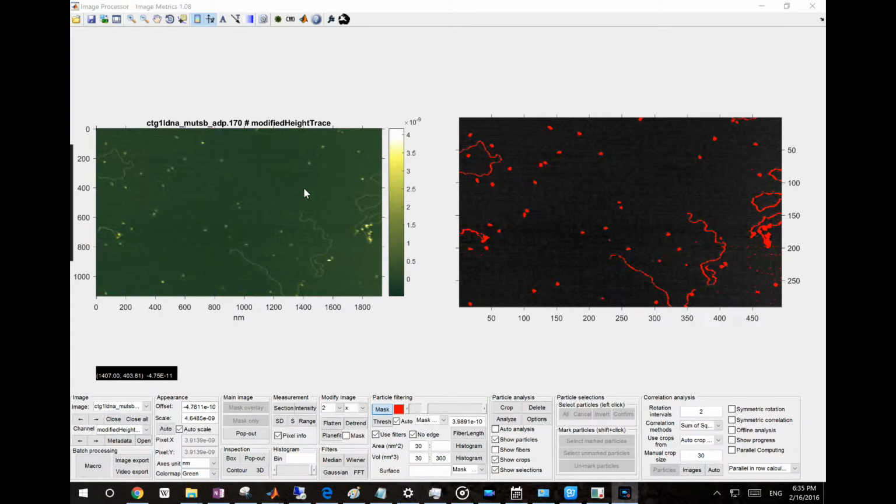In this video, I'm going to show you how to do data export. There are several ways you can do it. For example, you want to export this image. You can right-click this. You probably can right-click on the right image as well. So there's an export image function there. And that's the same function as if you click the toolbar button, which is this one.